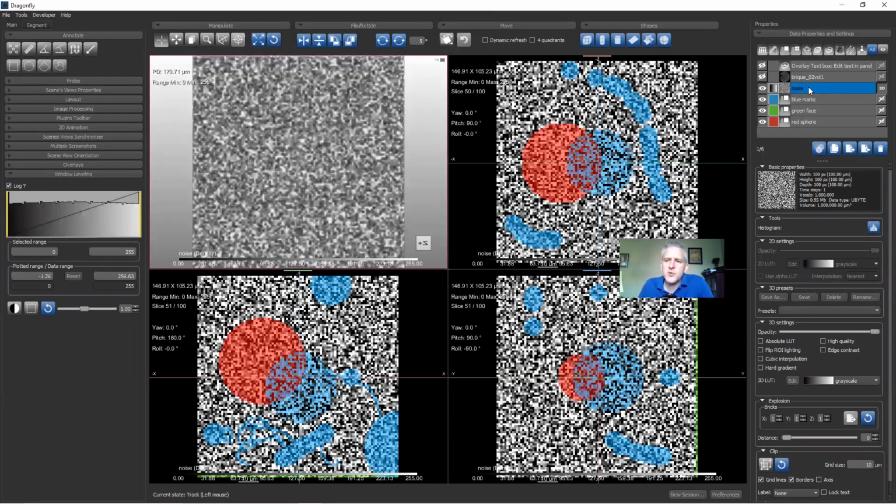What I will do for now is look at some of the elementary operations in this advanced segmentation tutorial. And then after we look at some of those elementary operations, we'll apply them in a workflow to process some of the porosity in this brick data set.